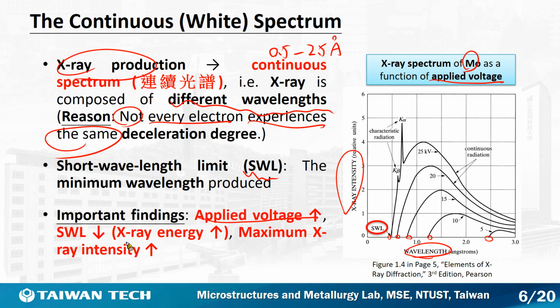So the X-ray energy will increase. And also you can see here for the intensity, if we increase the voltage, the maximum intensity will increase too.